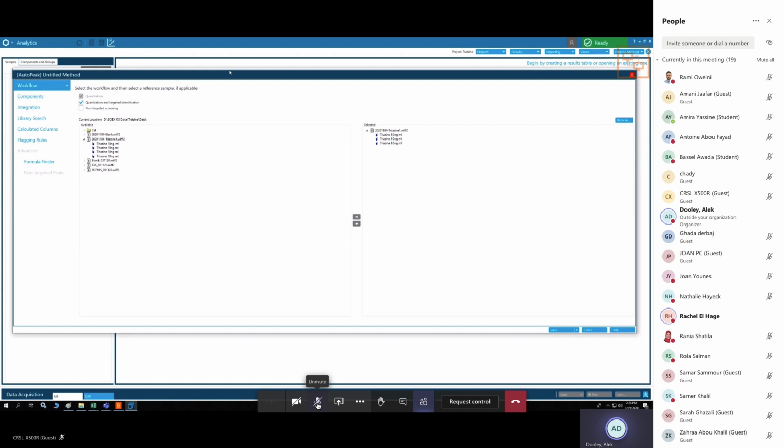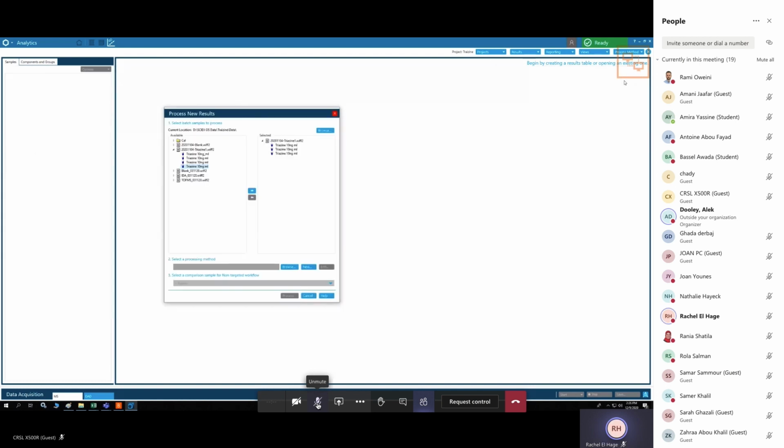Sorry, but I have a question. Have you run tracing with 3 different MS methods? To be honest, I don't know. No, it looks like no, they just did IDA. Just IDA. Okay. Yes, correct. Okay. Yes.